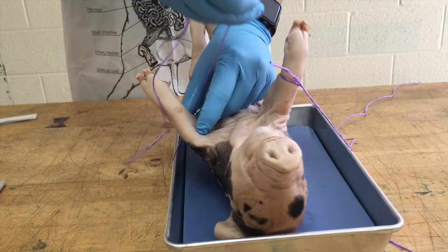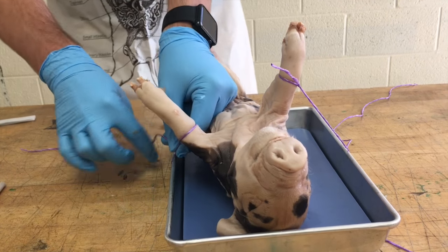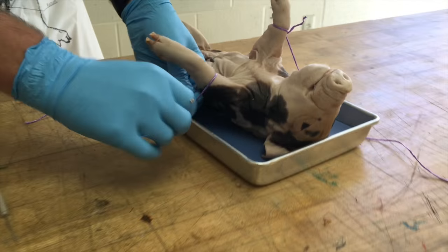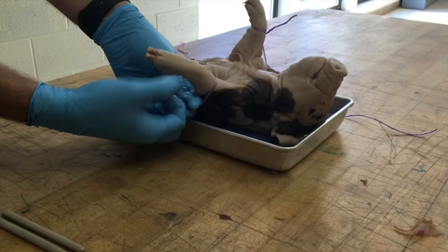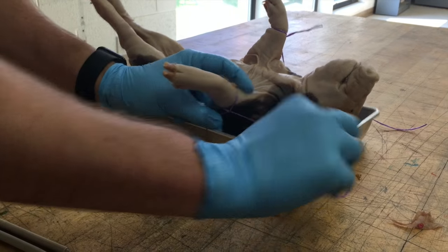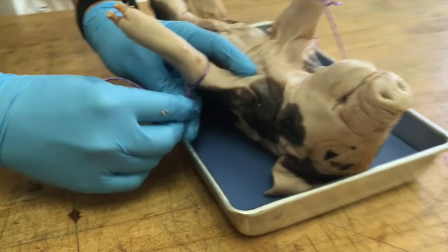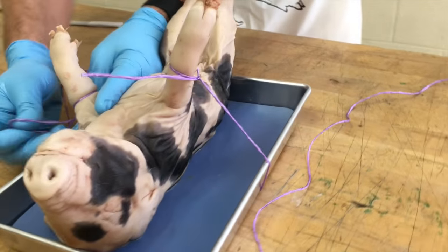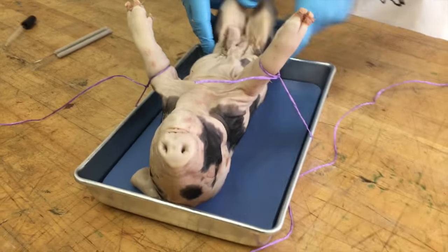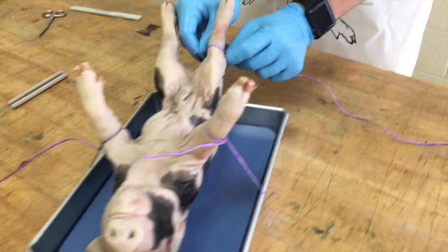Run it under the pan, pull it tight, and tie a knot on this side. Get it wrapped around there, pull it tight, and tighten up that knot one more time. If you don't get this step right, the pig is going to be moving around on the pan. The next step is to tie the hind limbs — you're going to do the same thing.